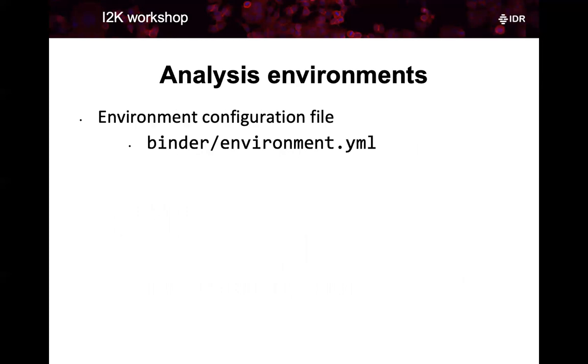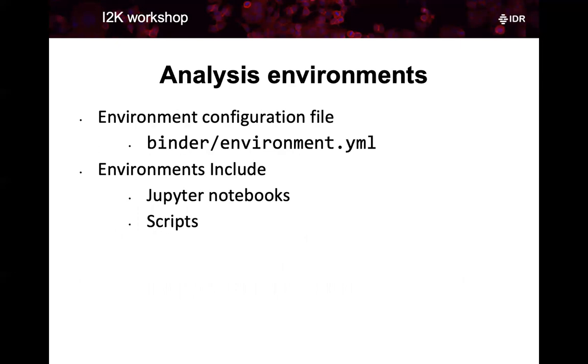Analysis environments are defined in the configuration file, which is under the binder subfolder of the GitHub repository. We will use, in this case, omero-guide-python. Environments have both Jupyter notebooks and scripts, so the examples inside the environments are provided as both Jupyter notebooks and scripts. And we have examples which are run in Python, Java, and R.